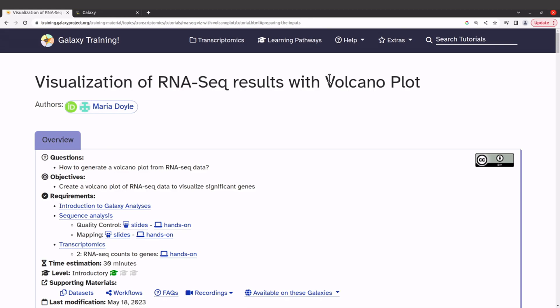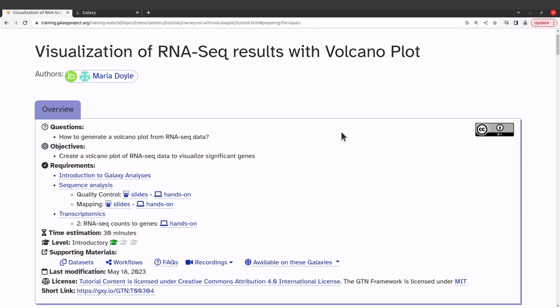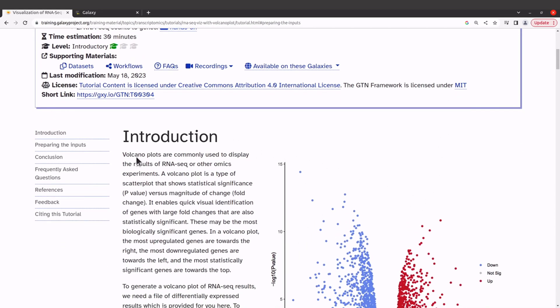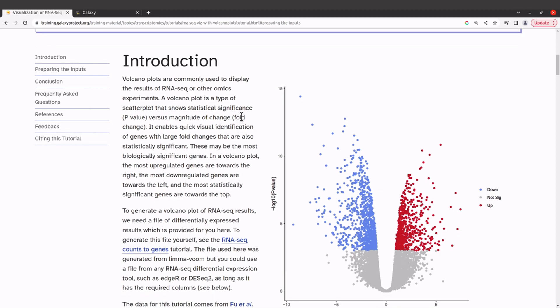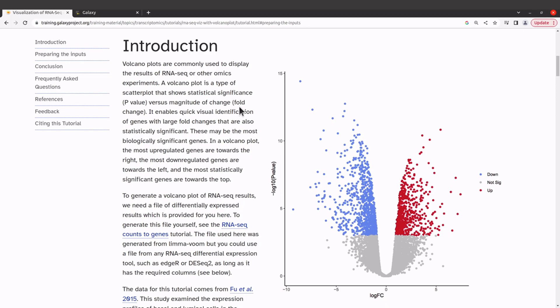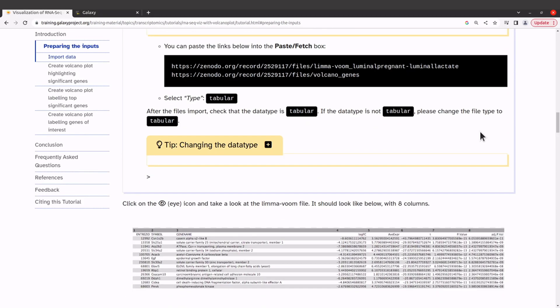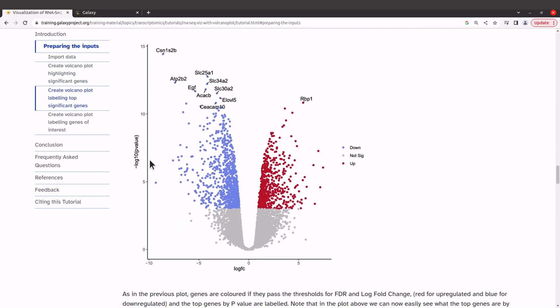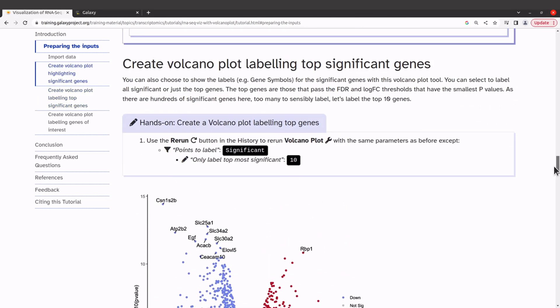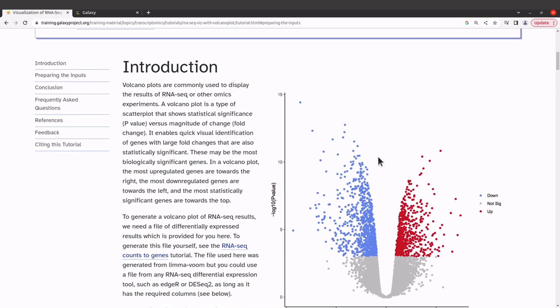By the way, I covered this same tutorial previously but used R packages to generate the volcano plot — check the description box for that. I'm doing this version using the Galaxy platform because some people may be beginners when it comes to programming. I'll also encourage you to read the introduction, which tells you what volcano plots are. Basically, volcano plots allow you to visualize lipidomic results and show statistically significant genes.